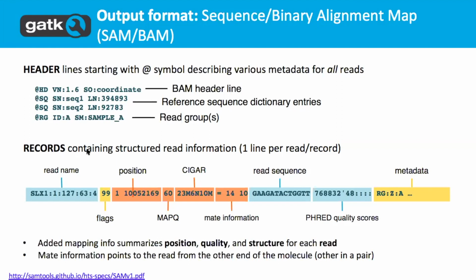If traditionally you were doing quality trimming, that's not necessary at all, because the variant callers will take the quality of the bases into account. It's actually used as part of the variant calling model. So it's really not necessary to do any quality trimming, or adapter trimming either. The adapters will be marked and recognized and ignored accordingly.